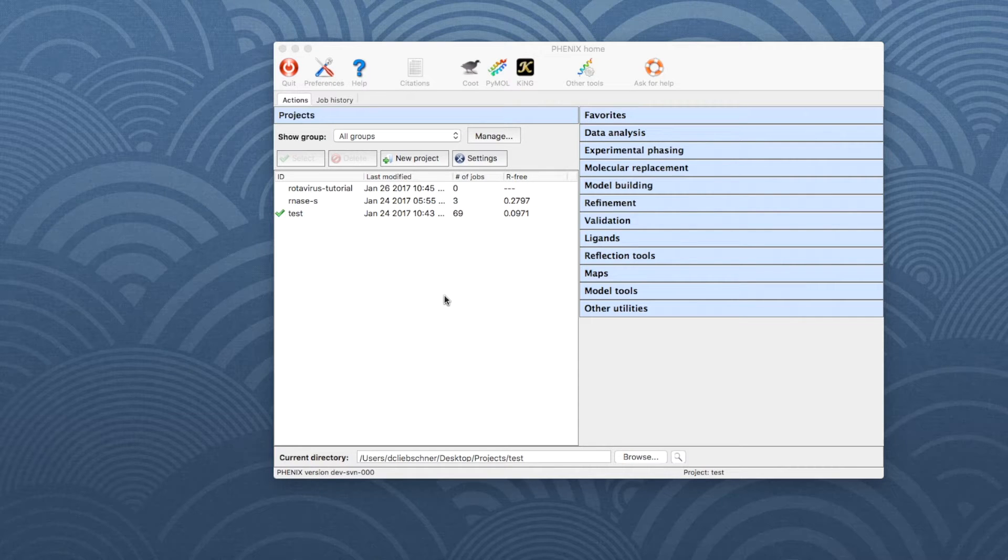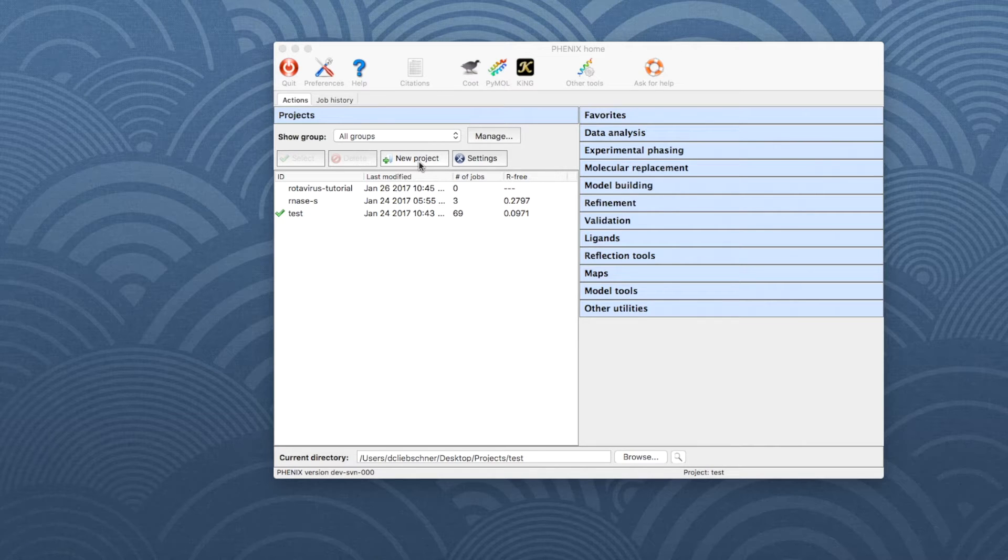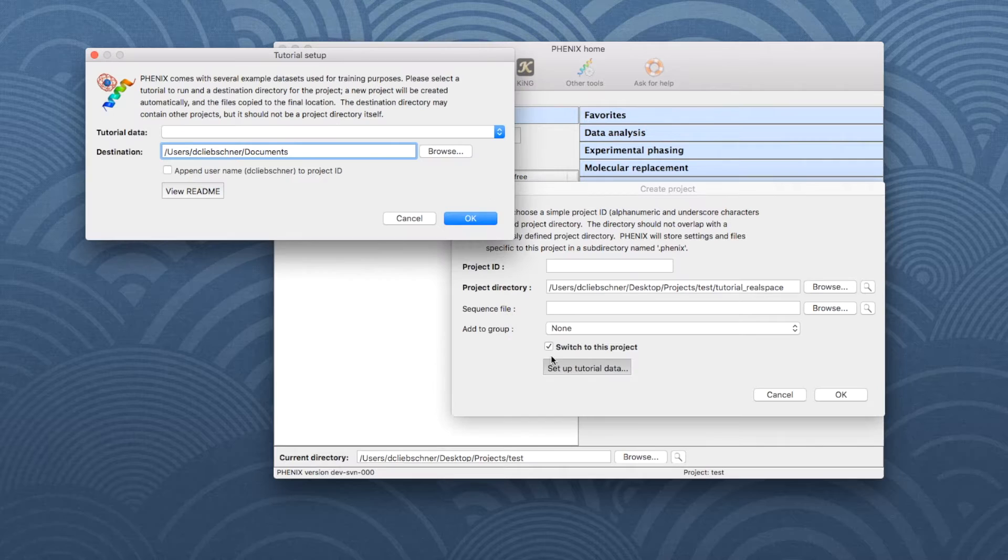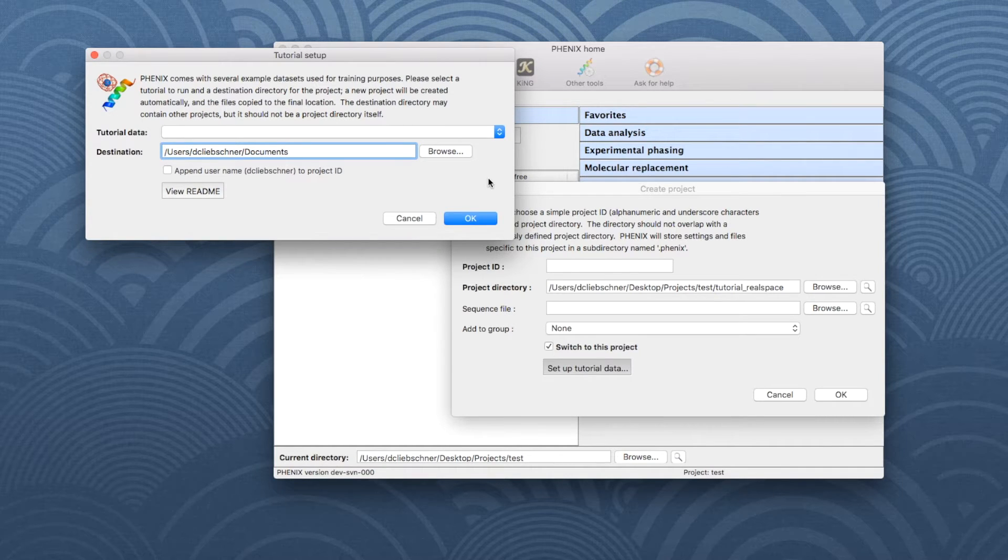To set up the example data, open the Phoenix GUI and click on New Project. In the new window, click on Setup Tutorial Data and another window appears.